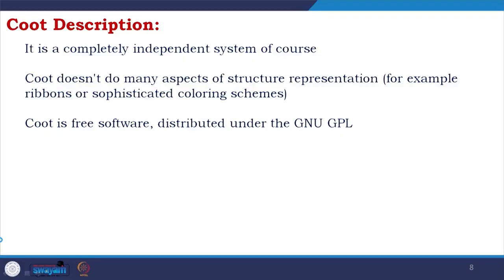Coot is not making beautiful figures, but it would help you to develop the concept, develop the idea, so that you could make a good figure by designing it from Coot, going to those other softwares.